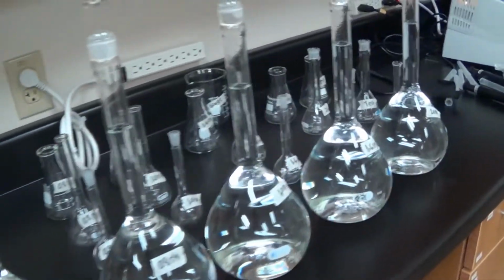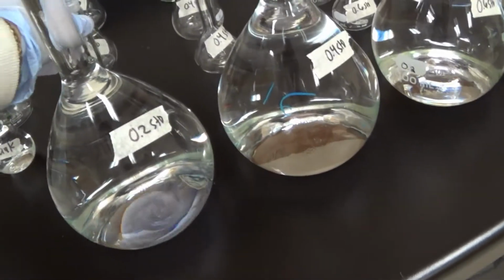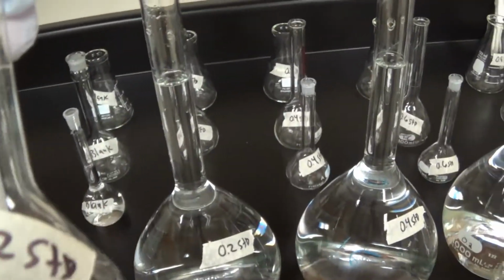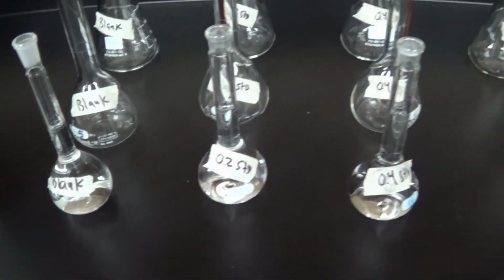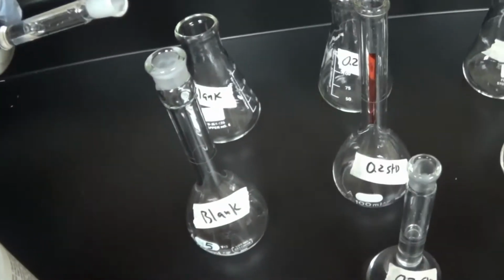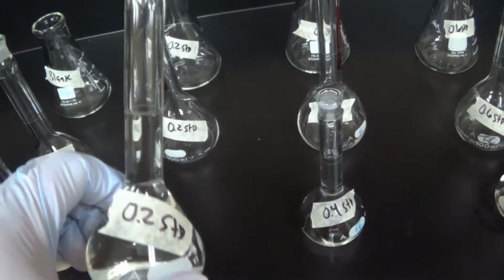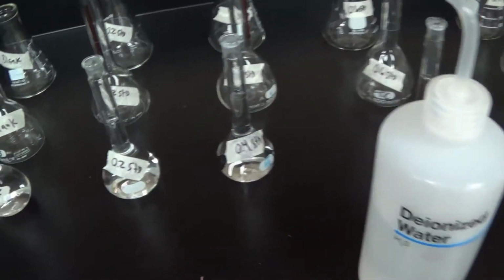All of the standards have been made. I put on some tops on there. I'm going to mix them really, really well. And then out of that, I'm going to pour 50 mils of each into their respective 50 ml volumetric flasks. Okay, I have 50 mils of each standard, the test sample, and the blank poured off. I am going to now add this to the 100 ml flask, and depending on whether you have a to deliver or to contain flask, I may rinse it out with some DI water and add it to that to get every little bit out. So I will do that now since I only have 3 hands.